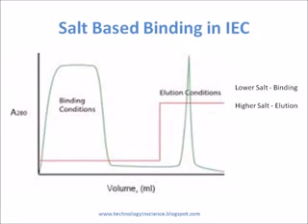the functional group. By increasing the salt concentration, generally by using a linear salt gradient, the molecules with the weakest ionic interactions start to elute from the column first. Molecules that have a stronger ionic interaction require a higher salt concentration and elute later in the gradient. The binding capacities of ion exchange resins are generally quite high. This is of major importance in process scale chromatography, but is not critical for analytical scale separations.